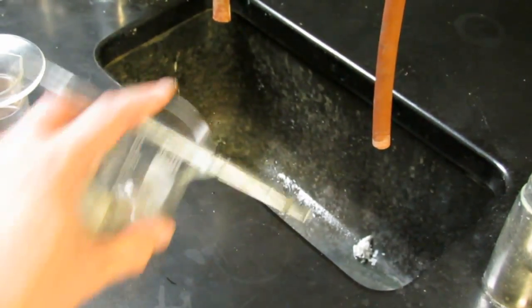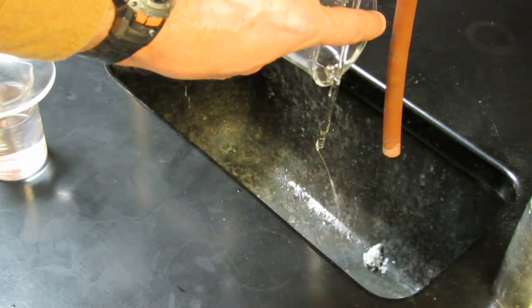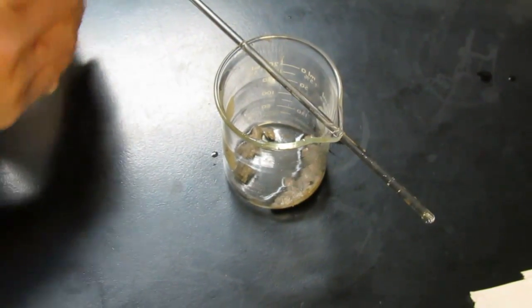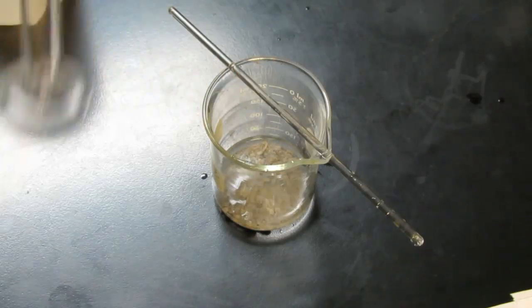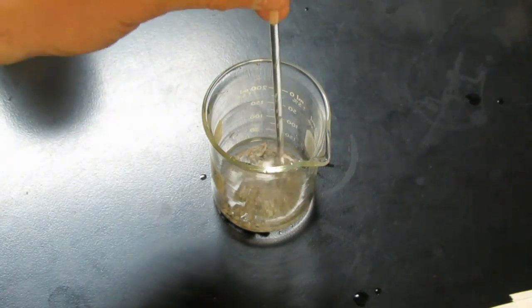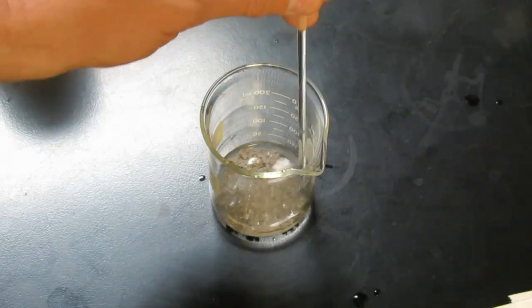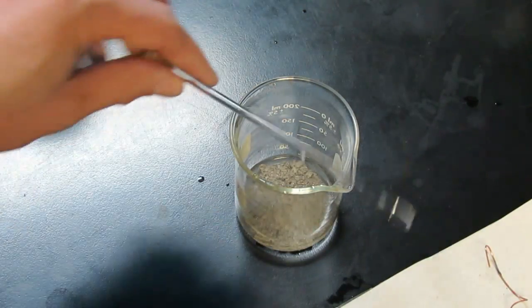So now we'll decant again. You guys will be really good at decanting by the time we're finished with this step. Once again try not to lose any silver. And we'll repeat that process again. So we're going to get another aliquot of about 10 mils. Add that to the beaker. Use our stirring rod to mix that up ever so gently.